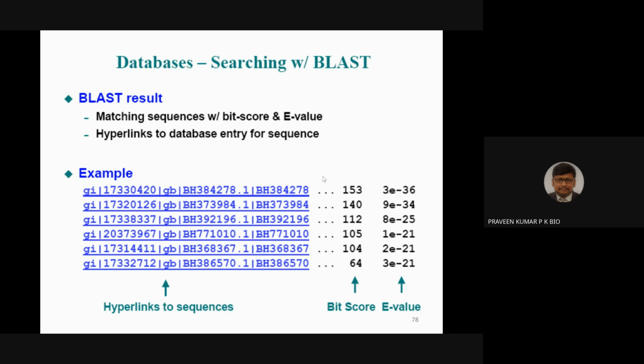A few results are shown here, bit score and e-value. In BLAST, we can also measure the significance of BLAST through e-values. The significance of BLAST is generally measured through e-values. Even this is an important question, we can anticipate it in GATE, the Common Entrance Examination.